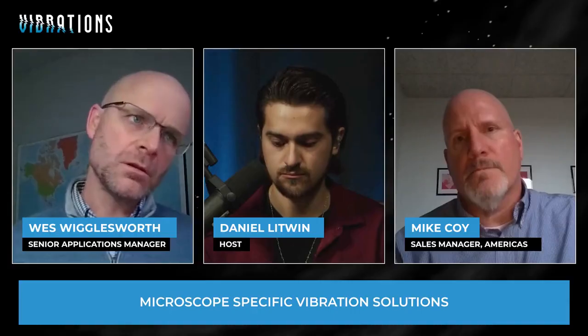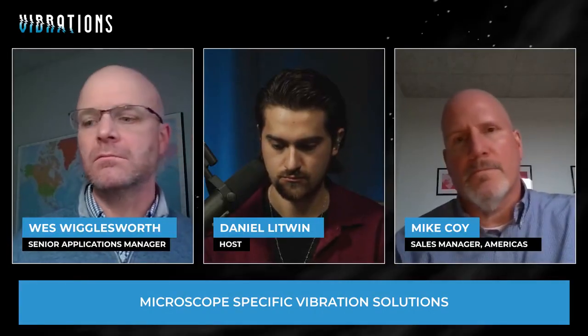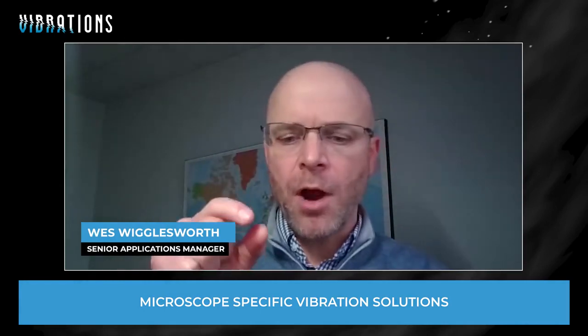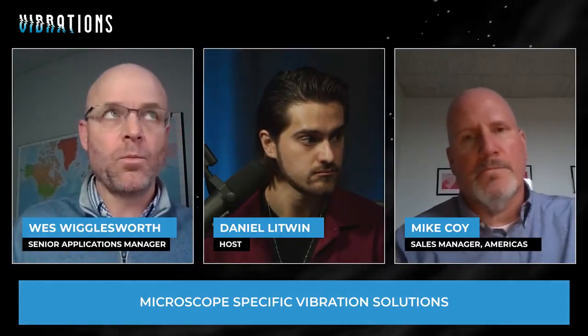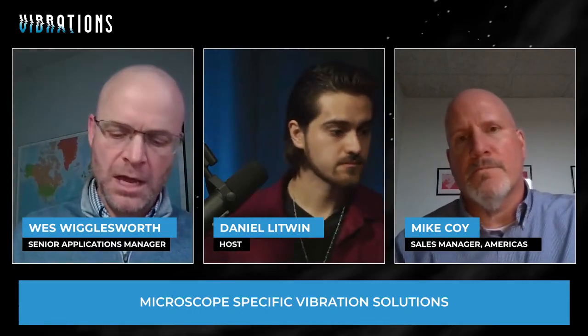And when you think about the nanometer scale, it's about a billionth of a meter. The SEMs that are used in, say, semiconductor manufacturing, they're looking for defects on a wafer, say a 12-inch wafer. They're looking at a defect on a part of the wafer that's going to become an electronic circuit that goes into your phone. Well, to put that into perspective, imagine being on a satellite looking down on Earth, zooming in on Manhattan.